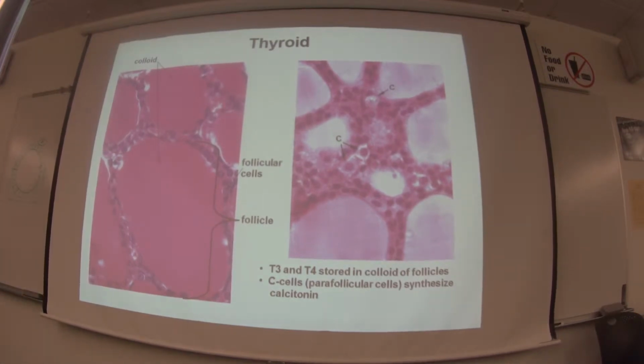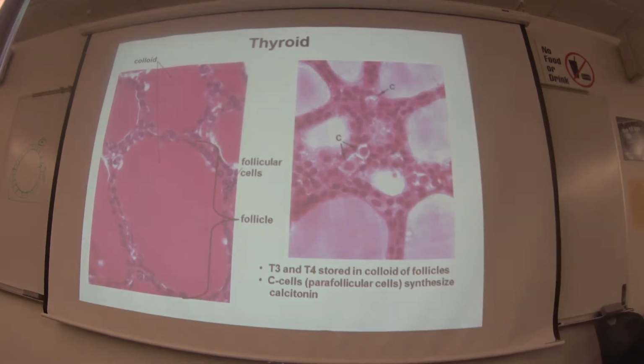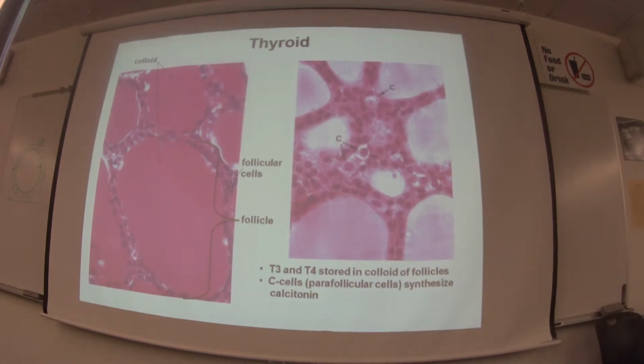And the colloid is the same terminology as the thyroid globulin? Yeah, so colloid is like, you have a liquid running in your veins. So it's a liquid, but we would always call that blood. Well, this is a colloid, but its specific name is thyroglobulin. It's the type of colloid. So it's more of a chemistry term when it comes to that use of the term colloid. But it would not be incorrect to say that this is a colloid. But the name of this particular colloid is thyroglobulin.